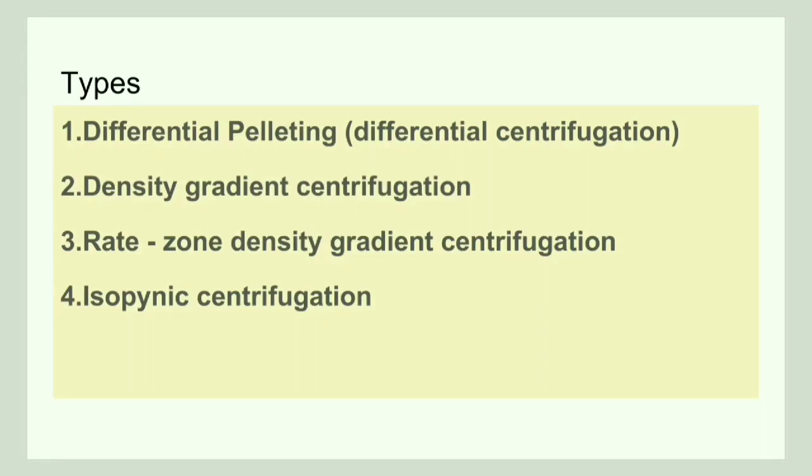So there are different types of centrifugation. First is differential pelleting, also known as differential centrifugation. Second is density gradient centrifugation. Third is rate-zonal density gradient centrifugation. Fourth is isopycnic centrifugation.